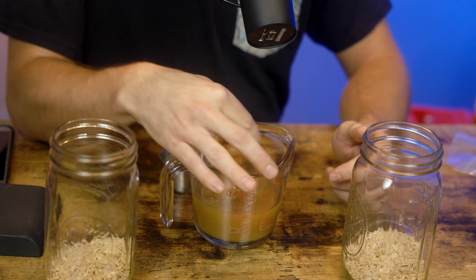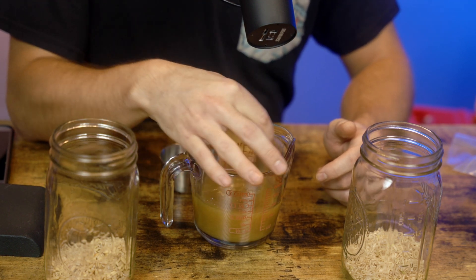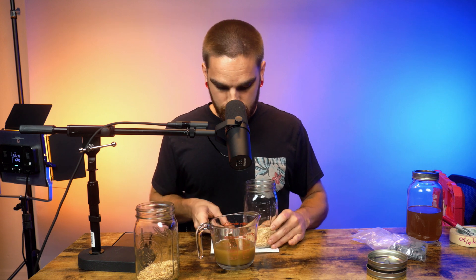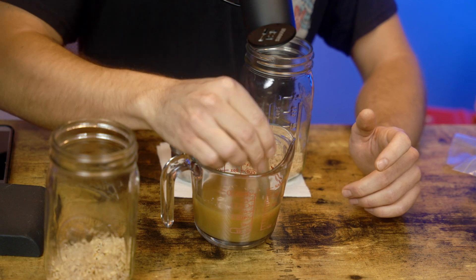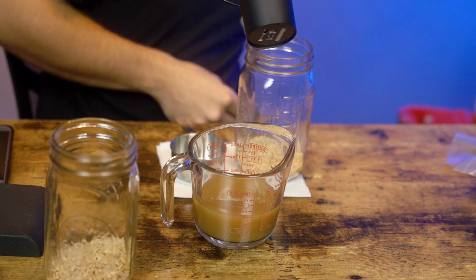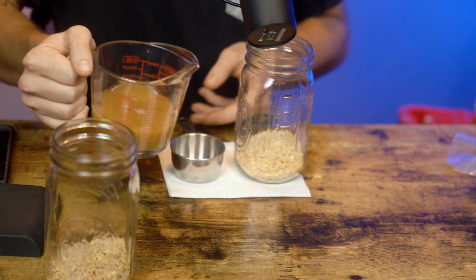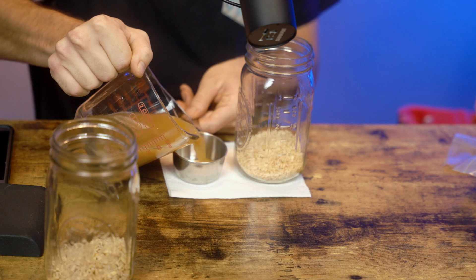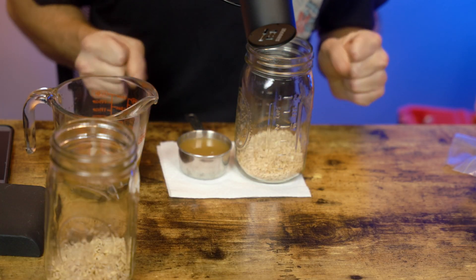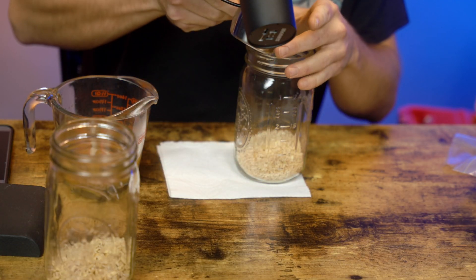Give the broth a nice stir to get it incorporated, making sure it's not sticking to the bottom, then pour a half cup into each jar. Be really delicate here — you don't want to spill. I think I drank a little bit too much coffee; I'm a little shaky.